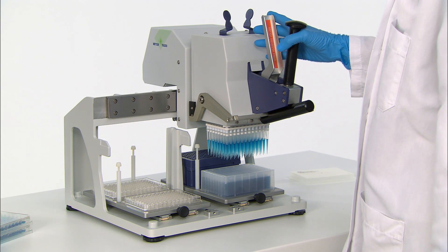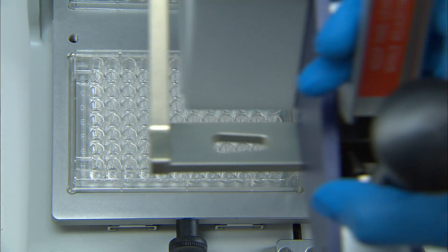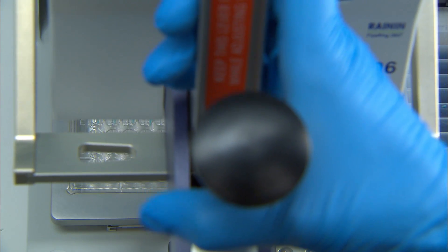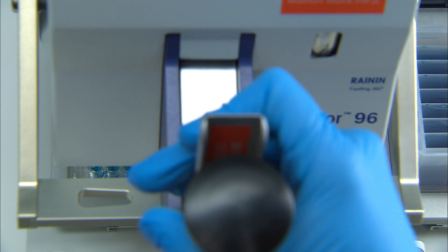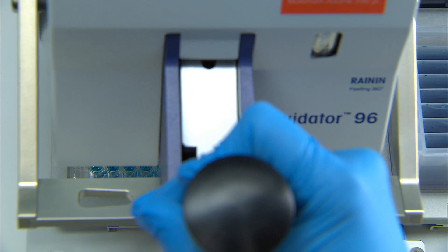When the liquid is aspirated, slide the liquid head to the left over the 96 well plate and push it down gently. Squeeze the lever again to dispense the liquid into the 96 well plate. Squeeze the lever one more time for the blowout step.